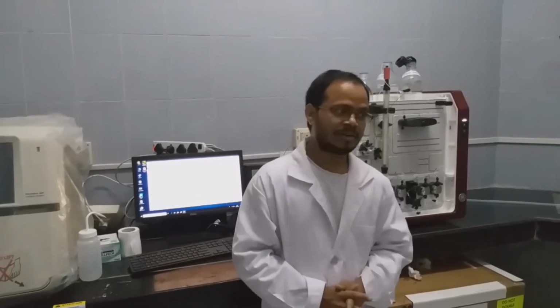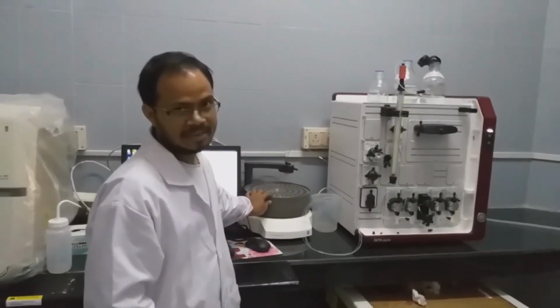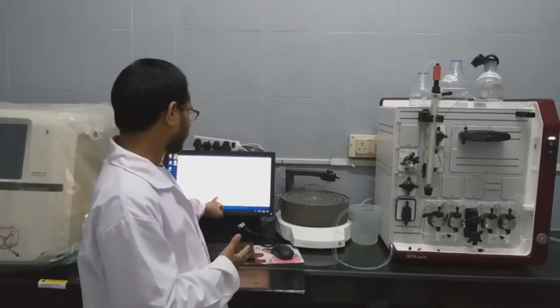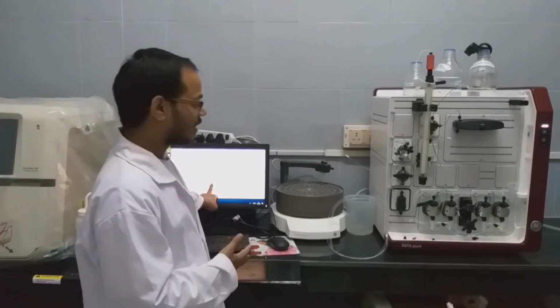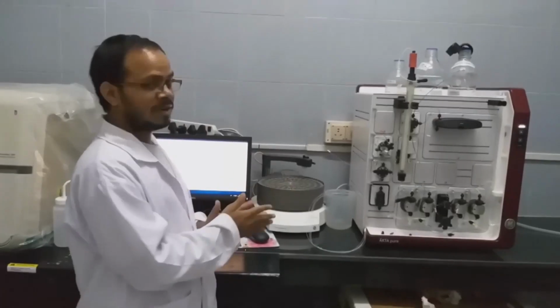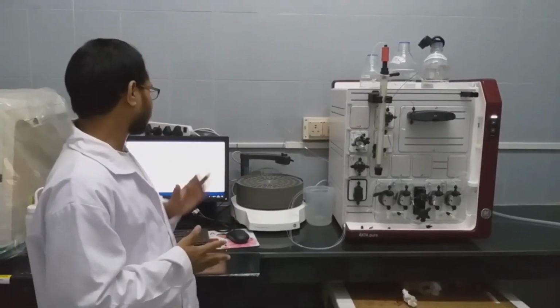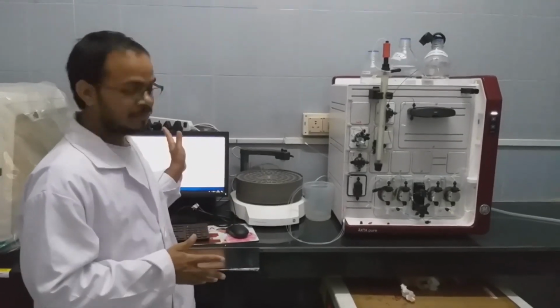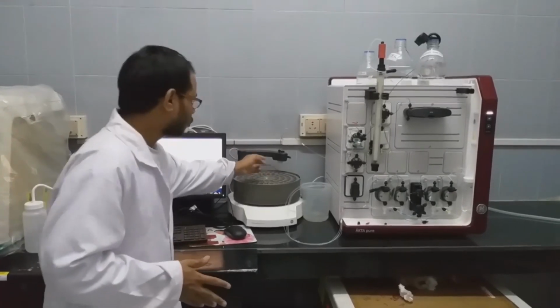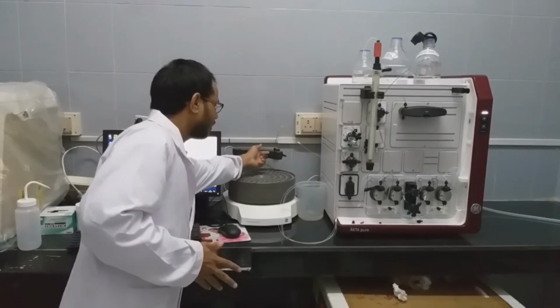Another point we forgot: this is the fraction collector. While your protein is eluting, suppose it starts eluting at 12, you want to collect fractions from that time onwards till the end of the elution. You can use the fraction collector from the main window. It moves automatically. It contains a sensor, but you need not touch anything.